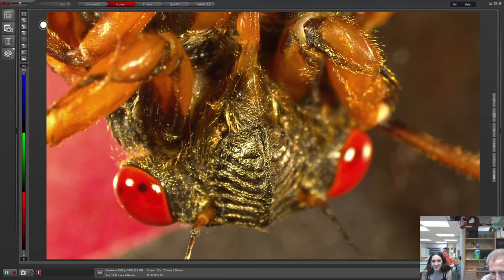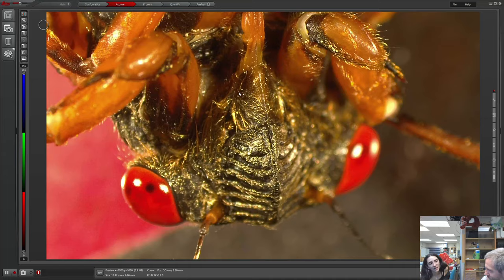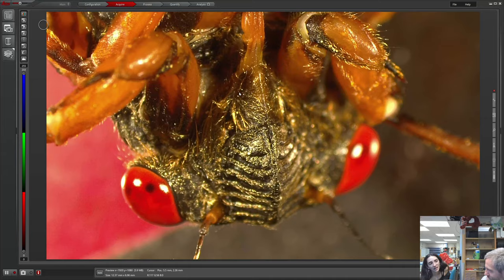You can see the noise-making organ — I think that's what I would call that thing. I always thought it came out of its head.